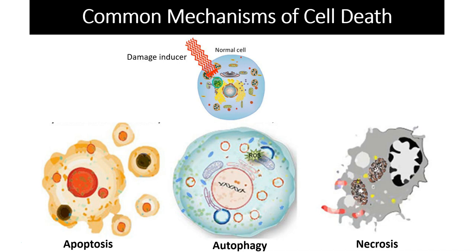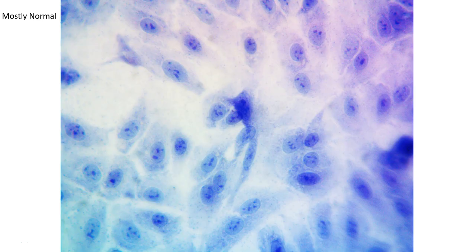So these are some of the things that you can look for when we are observing slides. Now let's look at some example slides and see if we can find some indication of these, some markers of these in actual stained slides. The slide images I'll show you are mostly images from student slides from the previous semester. So these are slides from students just like you doing their experiments in class.